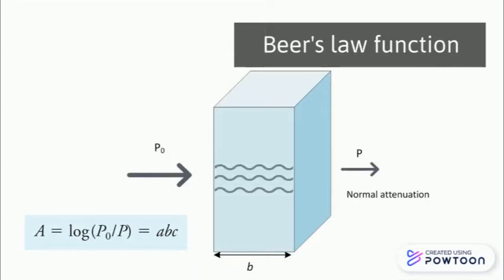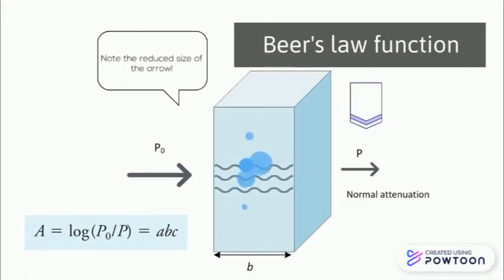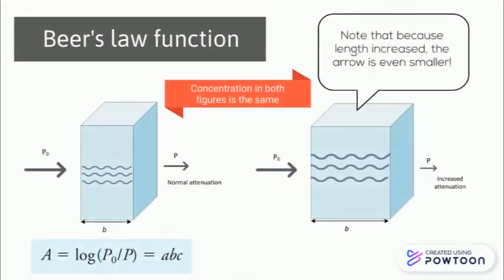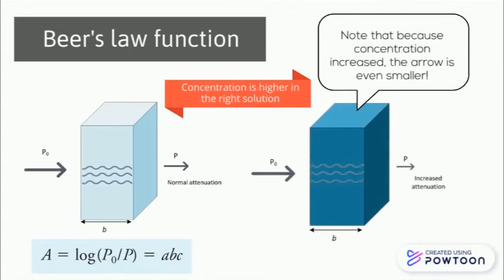As light traverses a medium containing an absorbing analyte, the light decreases as the analyte becomes excited. For an analyte solution of a given concentration, the longer the length of the medium through which the light passes, the more absorbers are in the path, and the greater the attenuation. Similarly, for a given path length of light, the higher the concentration of absorbers, the stronger the attenuation.